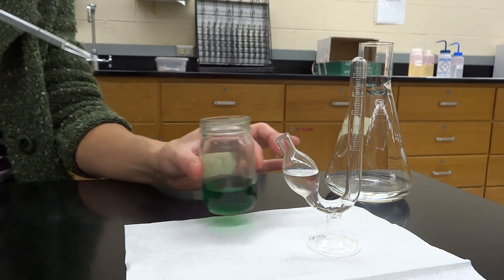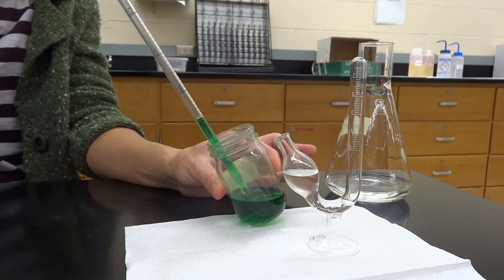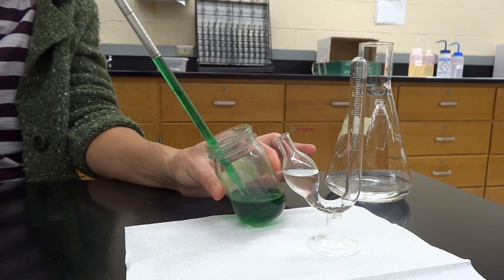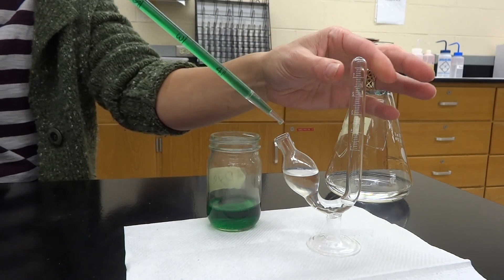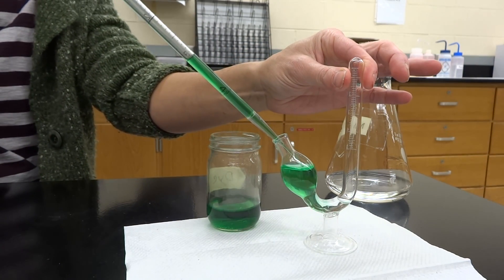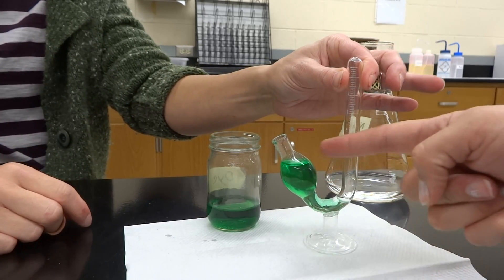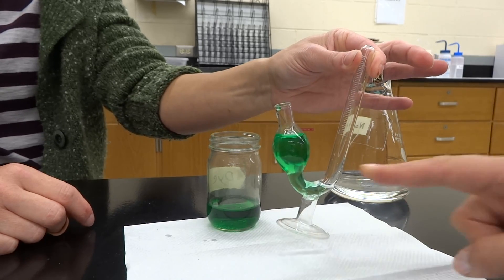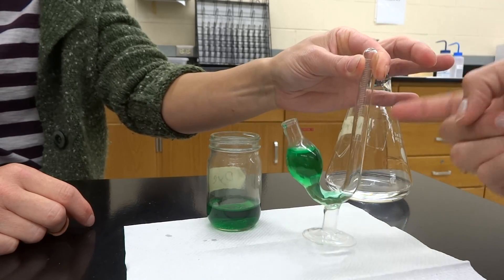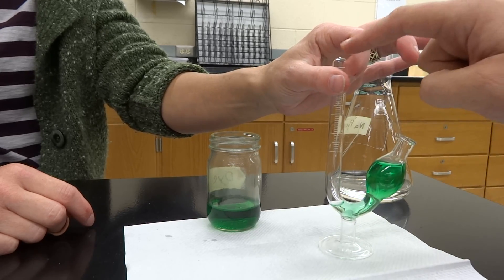Now we're going to take the yeast — which in this case we're using green dye; again, yeast is not green — and you're going to put five milliliters of the yeast solution into the fermentation tube. What you'll notice is that the green, in this case the yeast, is really concentrated in the little bulb. But we are going to be needing to measure the carbon dioxide, and that's going to have to be happening up here where you can see there's a little measurement area.